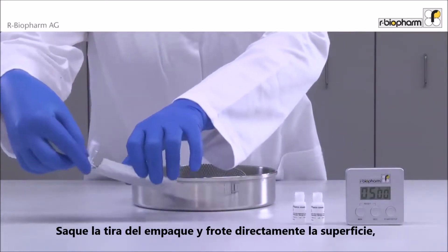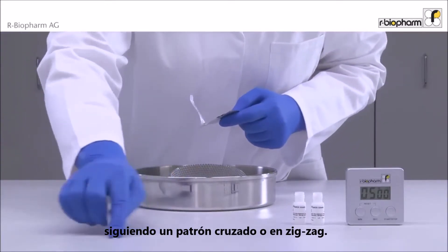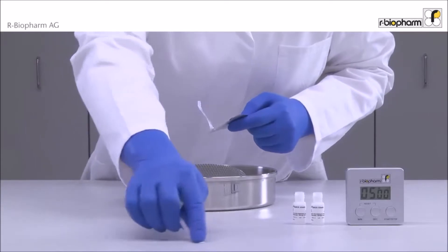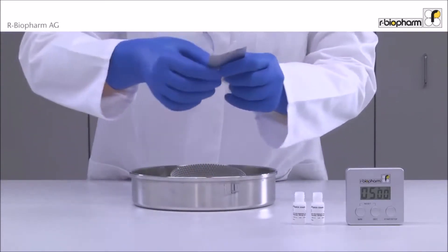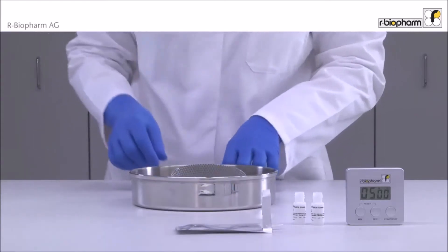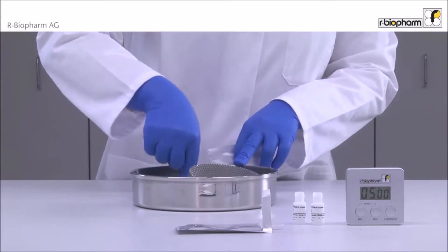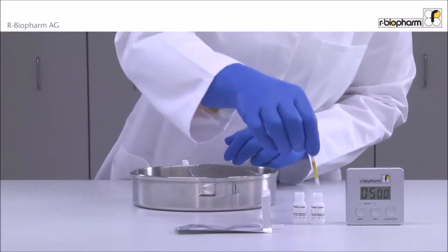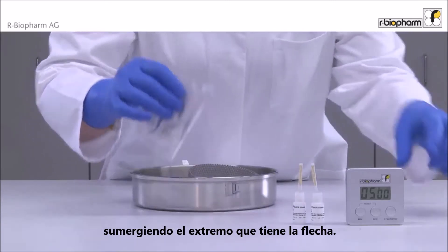Take out a strip and swab directly and thoroughly a surface in a cross-hatch or zigzag pattern. It is also possible to swab the inside of production equipment. Insert the strip directly into the buffer bottle with the arrow end into the tube.